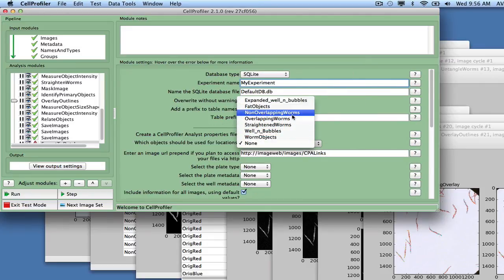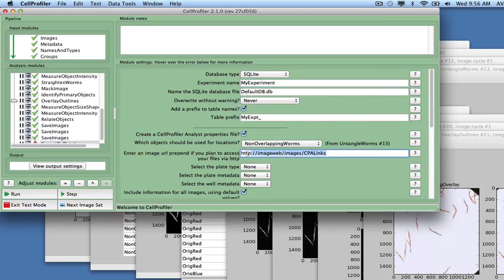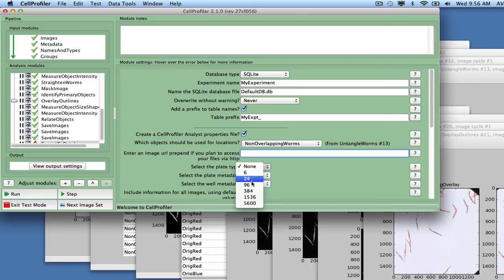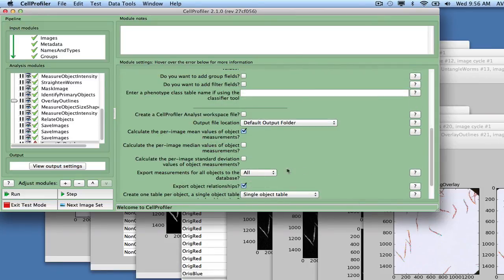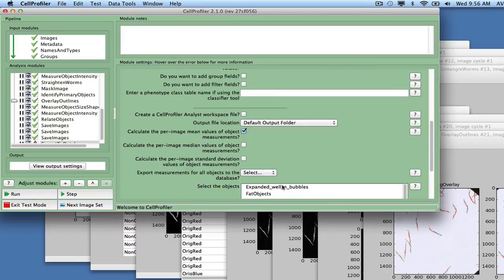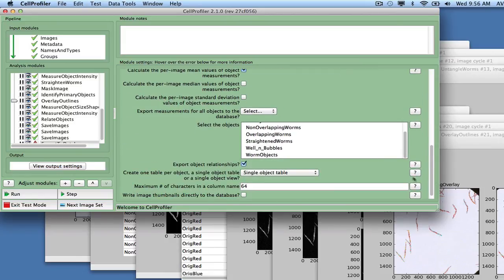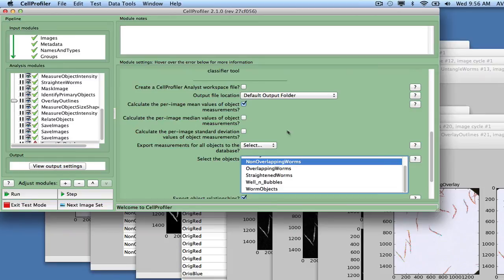Choose Non-Overlapping Worms as the objects used for location. The plate type should be 96. Set the plate metadata to plate, and the well metadata to well. Then specify that only selected objects will be used for export, and select the Non-Overlapping Worm objects.